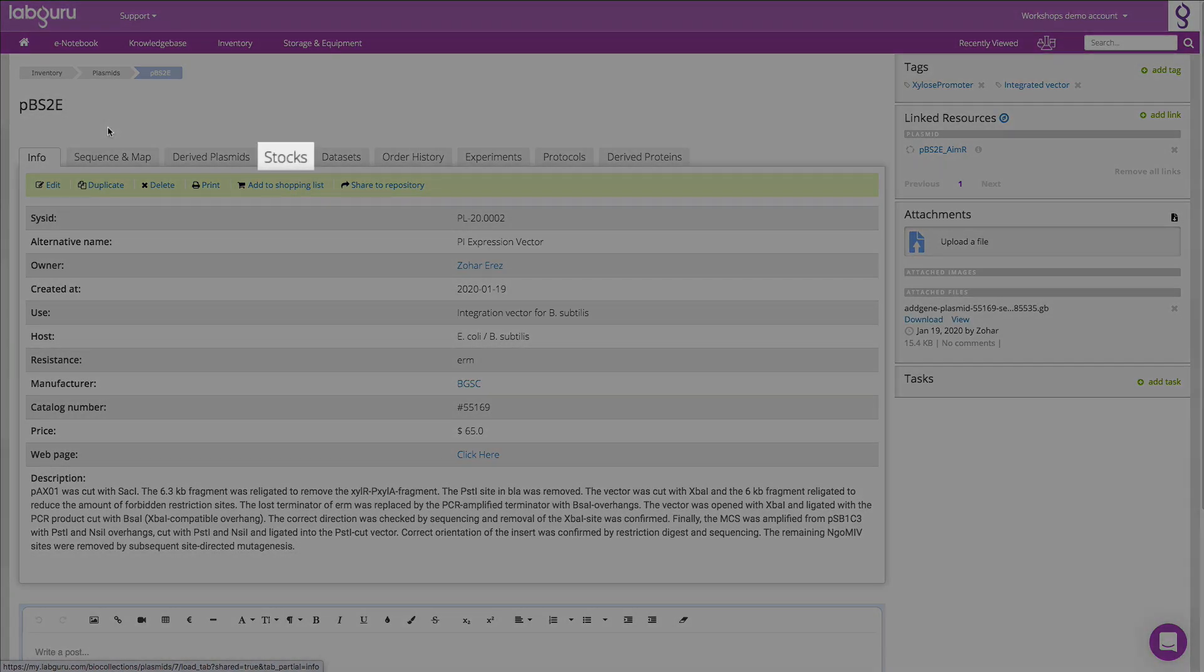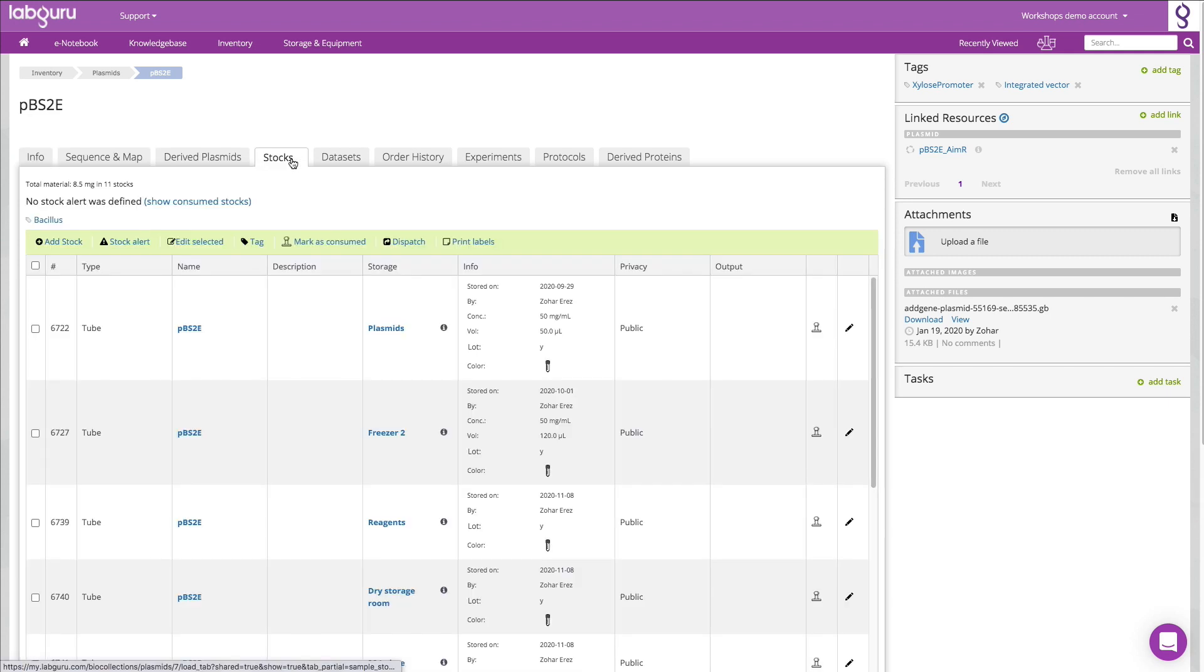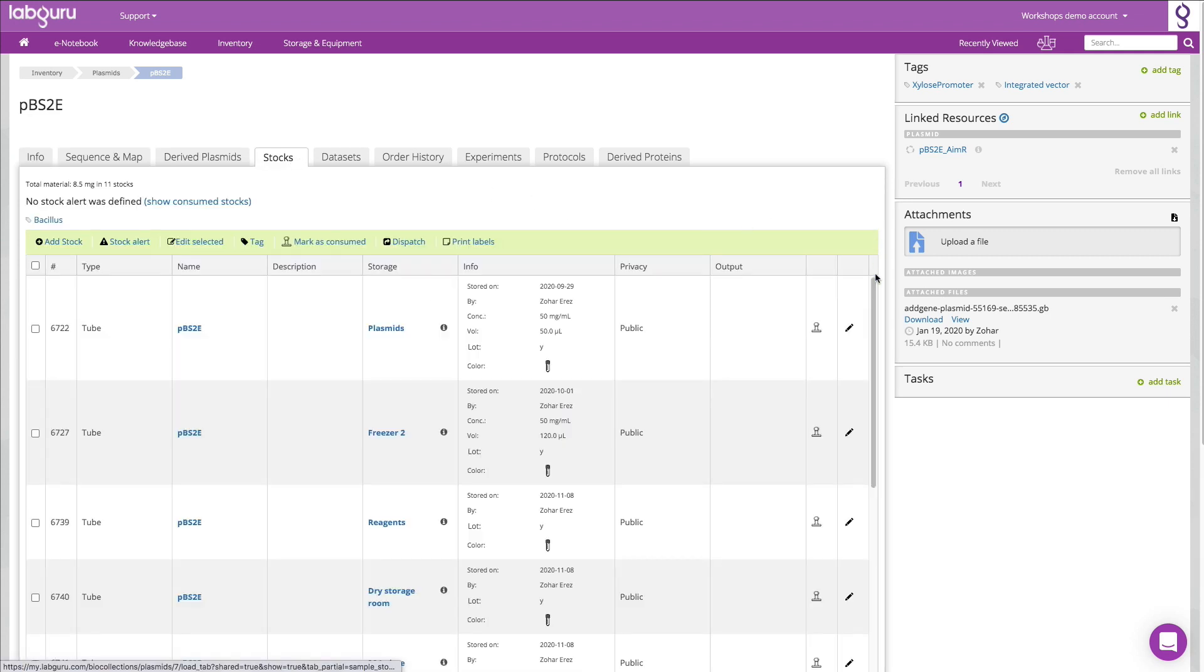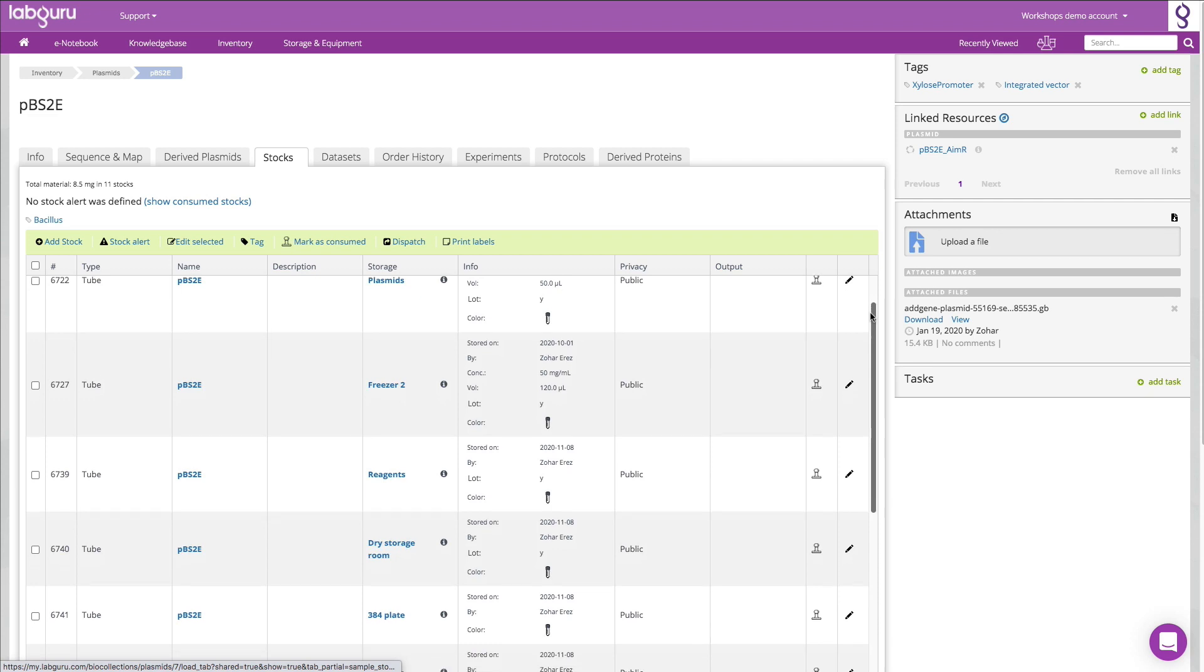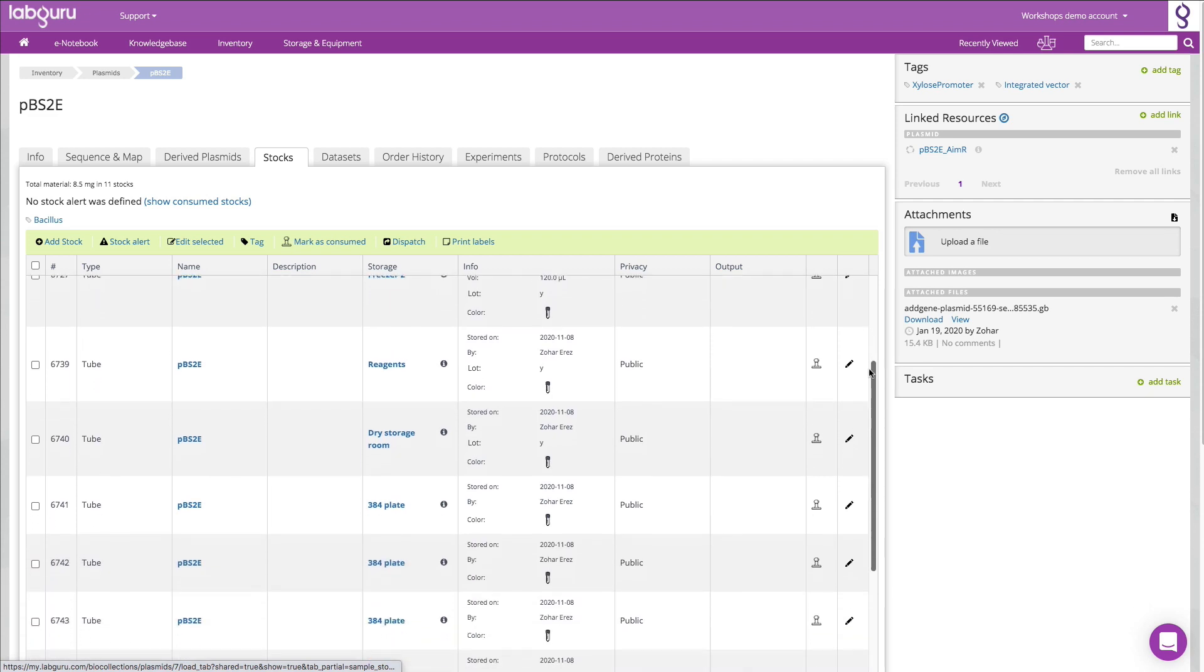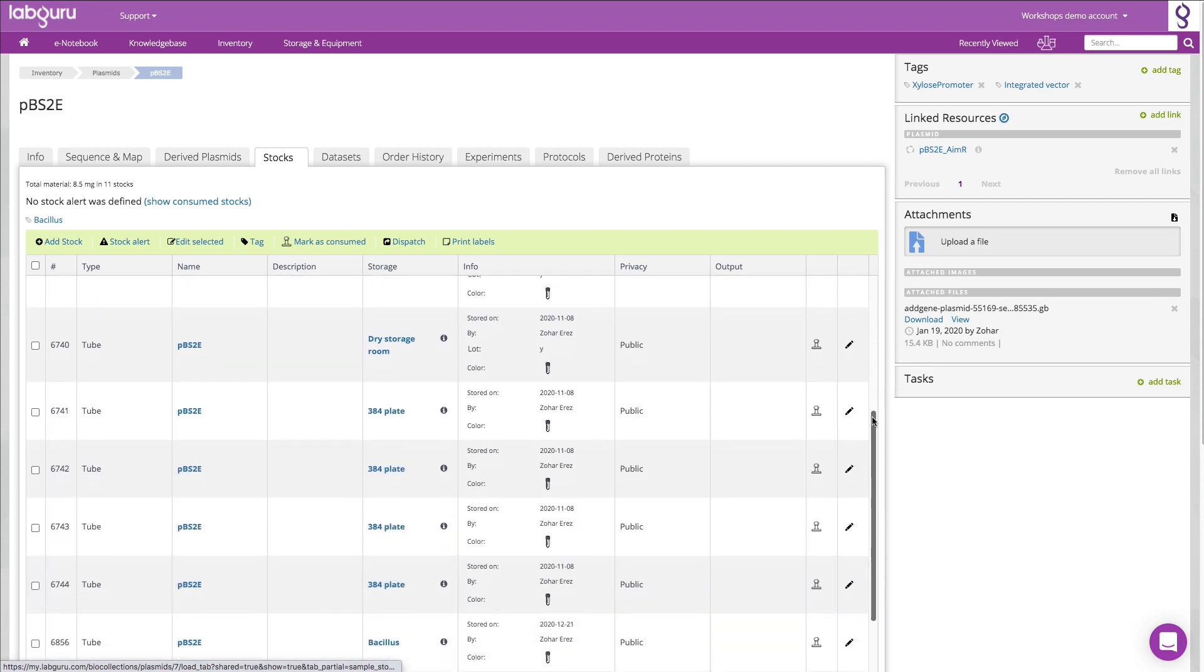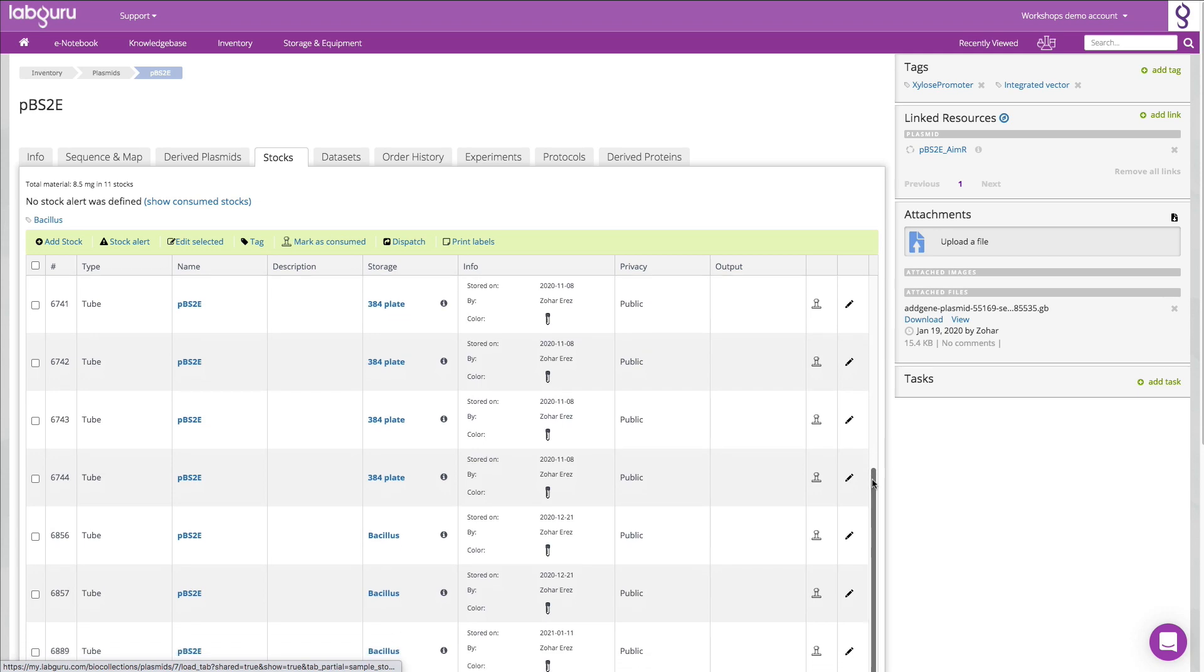For each item, you can also create stocks. Stocks represent the physical location of items in the lab, and those can be tubes, vials, bottles, slides, packages, and more.